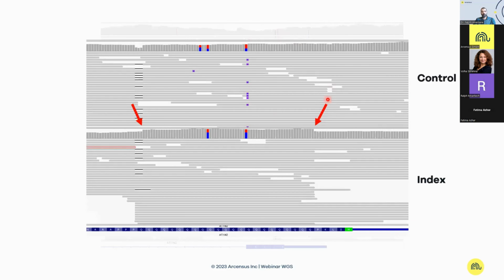And if we zoom in on that region, we see that there is what looks like something that is duplicated or amplified. The reason for this is that we have this polyglutamine stretch, which has the same sequence of nucleotides. Since this region is expanded, we would have in the index case more reads coming from this region that are similar. During the alignment, those reads coming from the expanded region will be aligned to this particular region, and therefore it would behave as if it is duplicated.